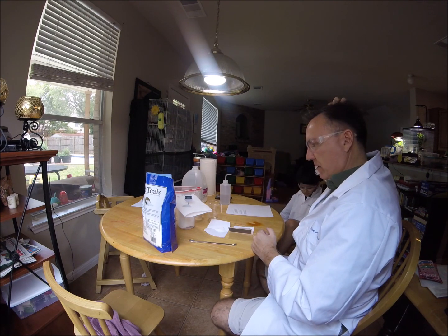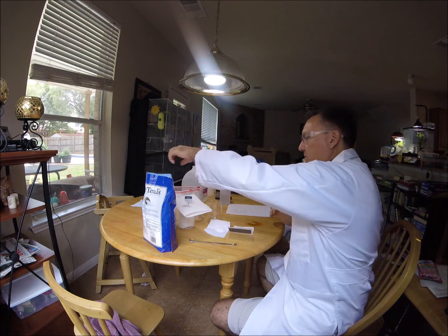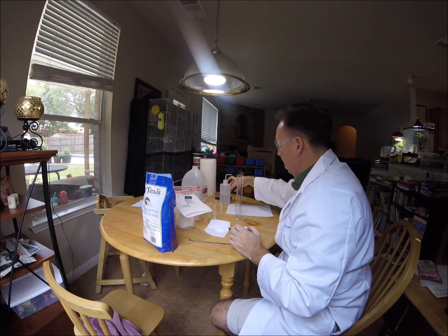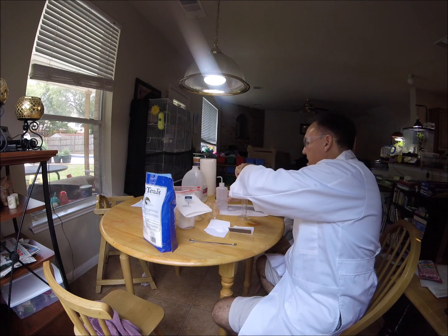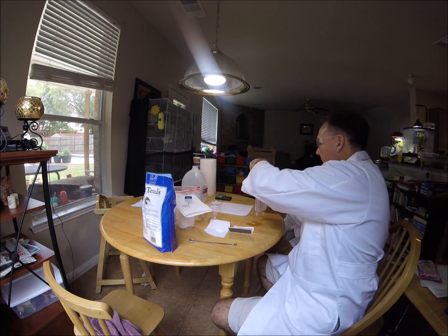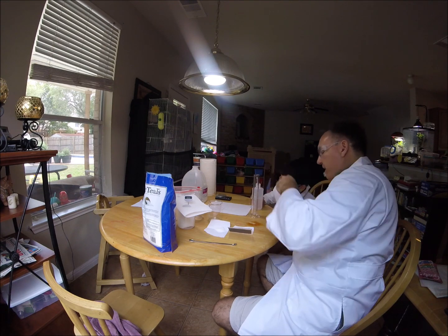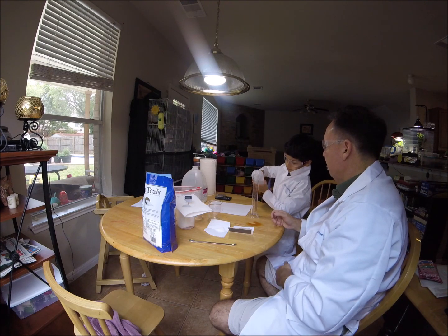All right, now we have our solids weighed out. Let's get our liquids measured. What we want to do is put 50 milliliters of water. Can you tell me when to stop? See that line? Now I'm going to teach you how to measure from the meniscus. I'll show you what a meniscus is.